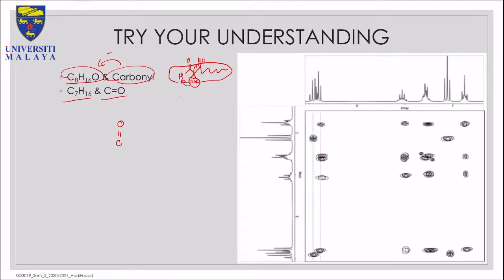If you see these 2-dimension proton NMRs, the first thing you do is draw a diagonal line. For a normal simple molecule like this you can draw a diagonal line, but for peptides and proteins you will not always work with a diagonal line.